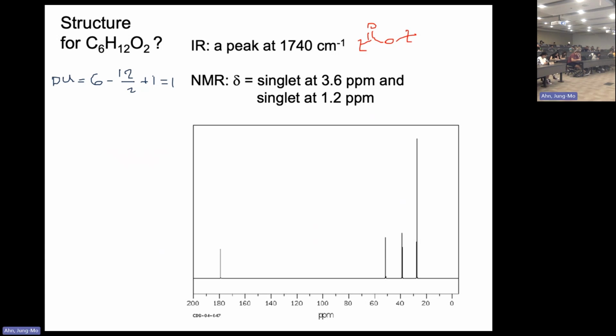All right. The proton NMR also shows this. See here, we got a singlet at 3.6. This must register to you. 3.6 means that the carbon that has these hydrogens must have an oxygen, right?